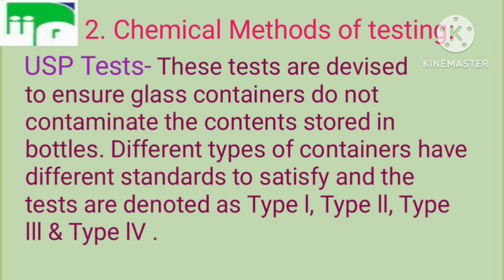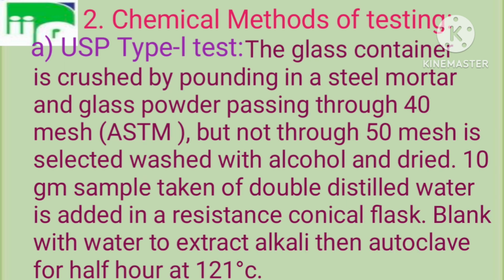USP test. These tests are devised to ensure glass containers do not contaminate the content stored in the bottle. Different types of containers have different standards to satisfy and the tests are denoted as type 1, type 2, type 3 and type 4. So, USP type 1 test.